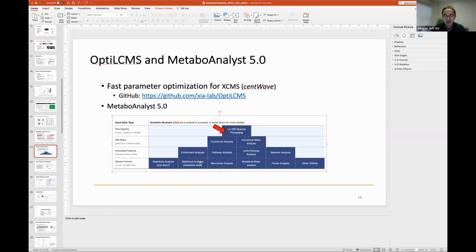This demand is so strong, and we could not postpone it. MetaboAnalyst 5.0 added this after publication, because when we were analyzing COVID-19, we realized we had to have tools to support people to do this. So please try this, and you should be able to upload the gathered metabolomic data to the analysis. And there are some of the new statistics to do covariate adjustment and so on.